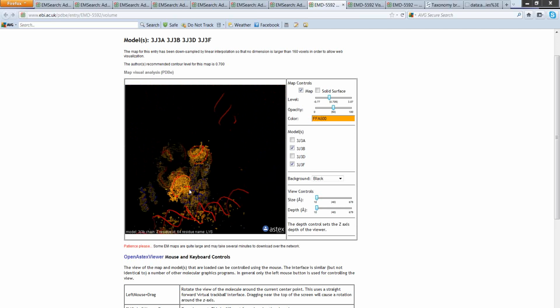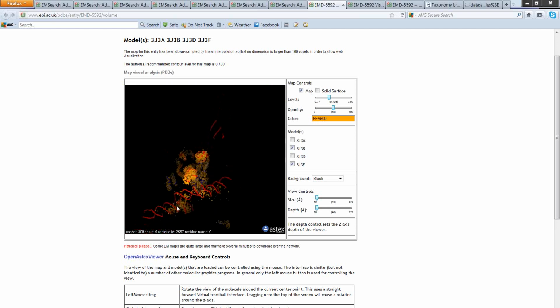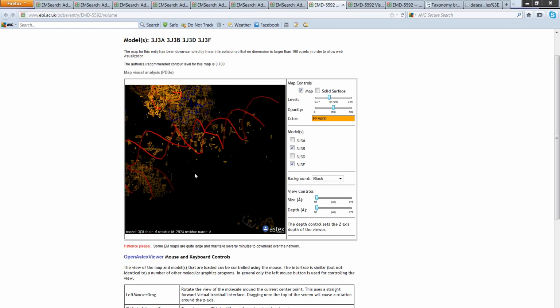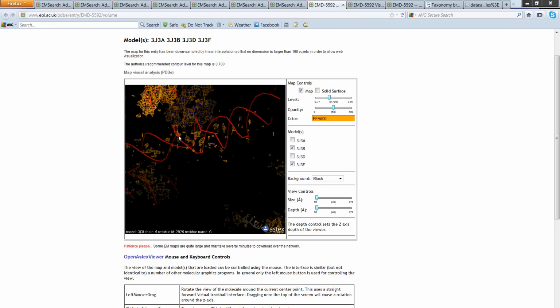And I'm going to just orient myself again so that I can see. So here we have the extension segment 27. And I'm particularly interested in a piece of protein which is in close proximity of extension segment 27, which is in blue here.